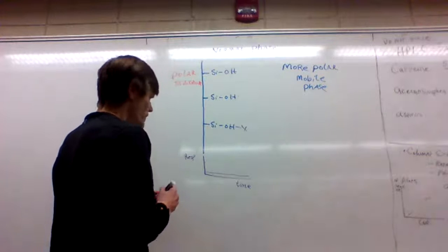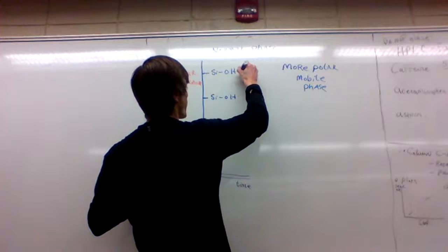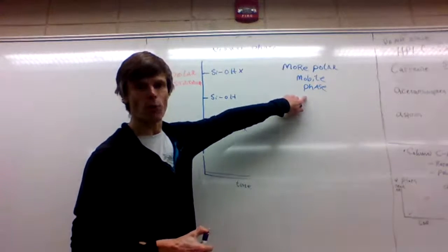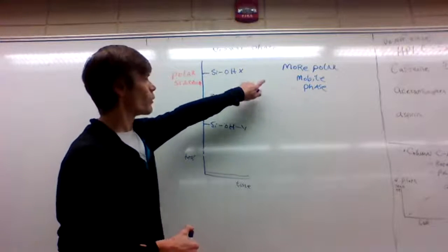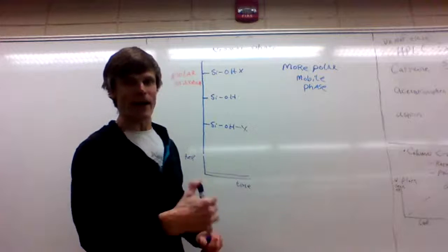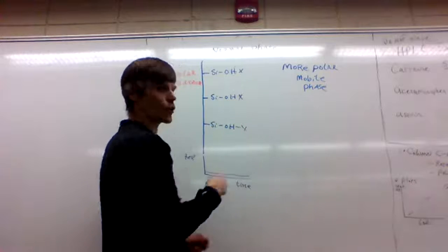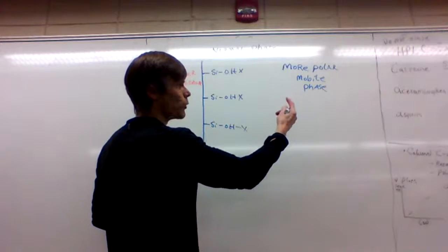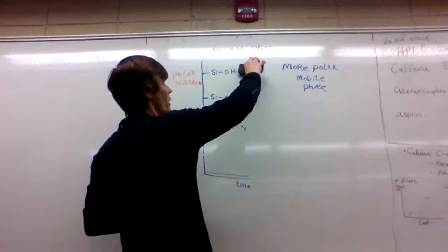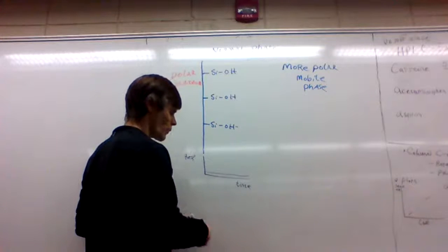Okay, we run this and we have X sticking. Well, now let's think, our mobile phase is more polar. So now the mobile phase will want to interact with our stationary phase, and it'll kick out X a little faster, and X will move down a little quicker, and then the more polar mobile phase will kick X off again, and X will move down the column a little quicker. And guess what?